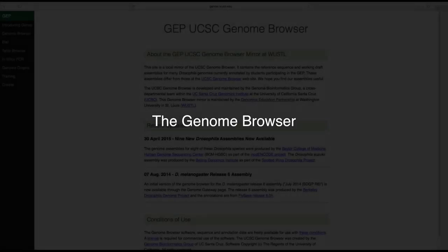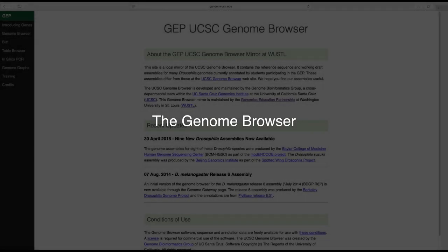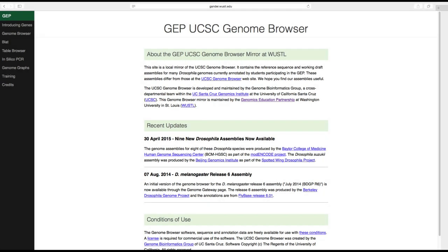A genome browser provides a way for us to view a genome sequence along with various pieces of information or features that have been identified in that sequence. You are probably most familiar with the term browser in the context of an internet browser such as Safari, Chrome, or Firefox, that provides a way for us to access and search for websites on the internet.